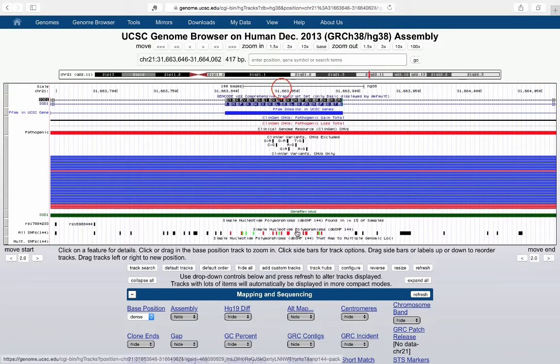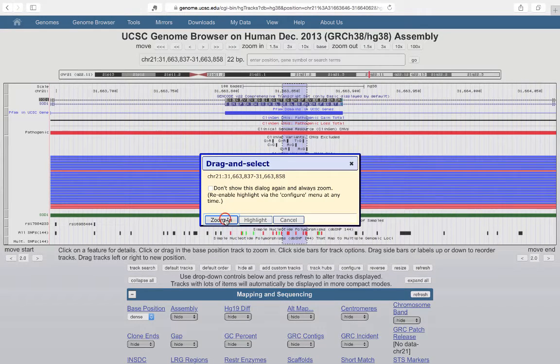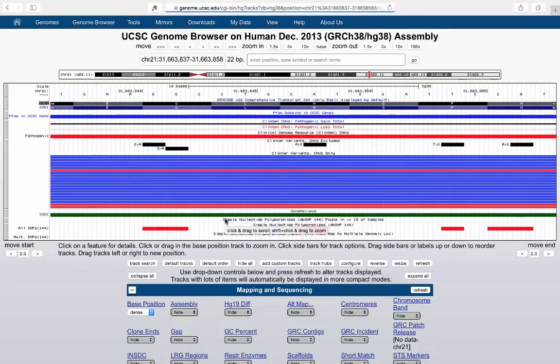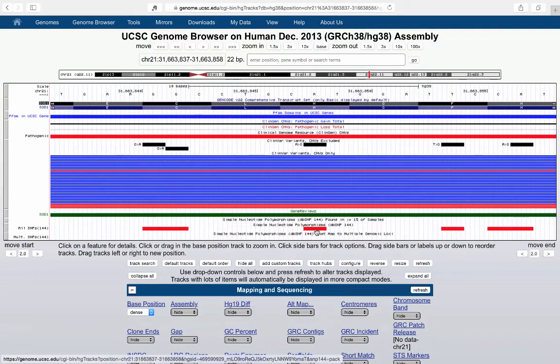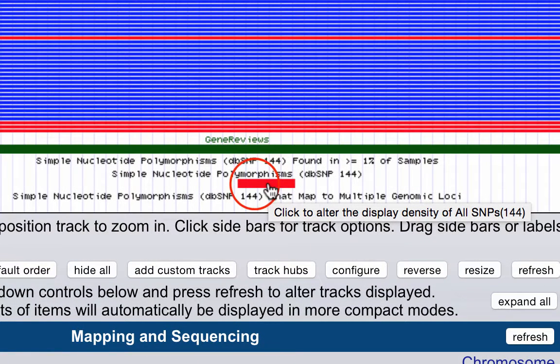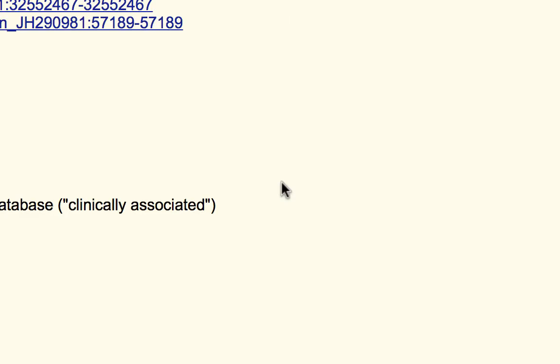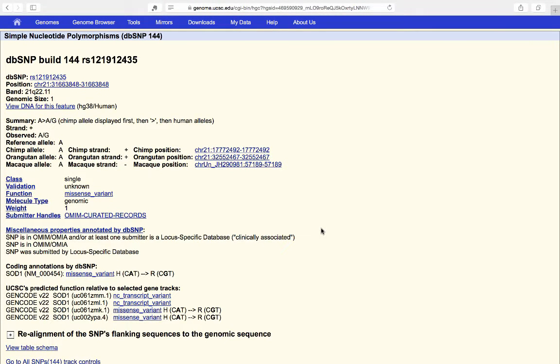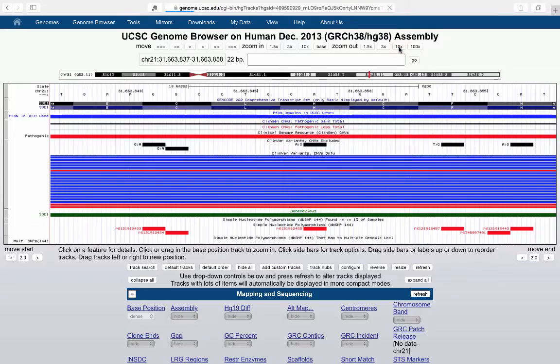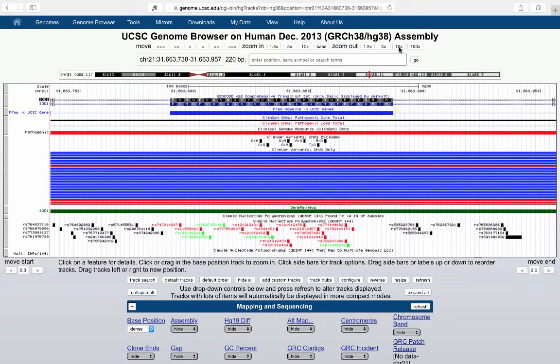Now we can zoom in on a particular SNP. Zooming in further, I've displayed the RS numbers and I can click through to get information about that particular SNP, including the dbSNP number, the position, the summary, the strand, and the allele frequencies. I'm going to zoom back out a bit — we're looking at exon 2 here.